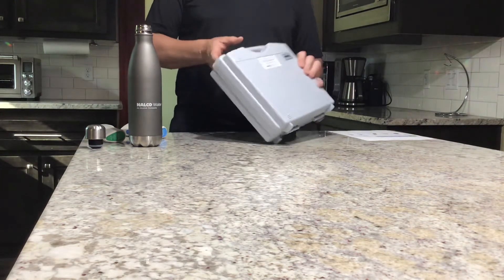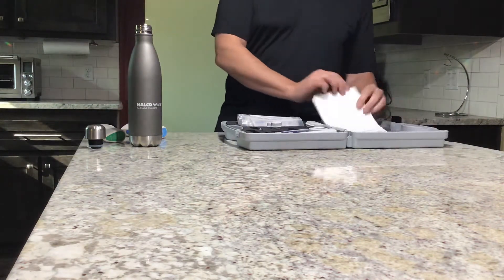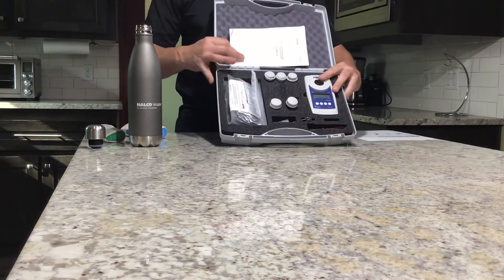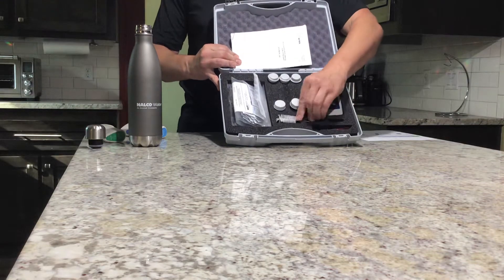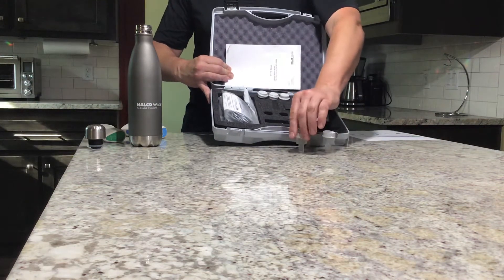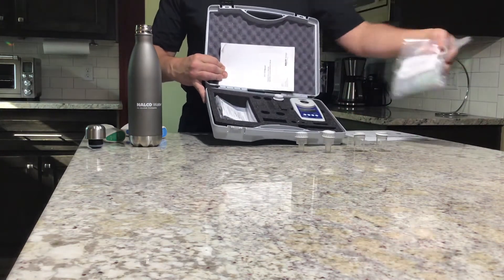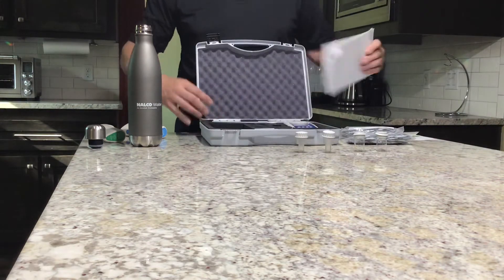This is the kit that it comes in. We're going to simply open it up and see what's inside. First you can see the instruction manual, and then it's got a warranty manual that comes along with it. Inside is the digital chlorometer itself, a screwdriver to open up the back panel, a cleaning brush for the sample vials, and then two different types of sample vials — the 5 and the 10 milliliter sample vials. It also comes with the free and total chlorine reagents, which are the DPD pillow packs.